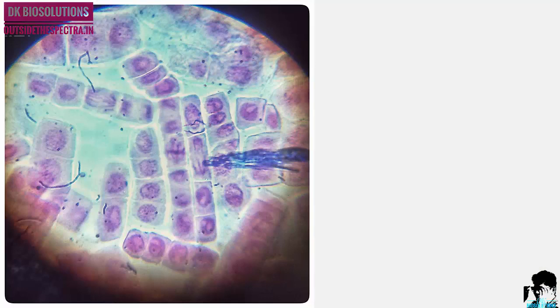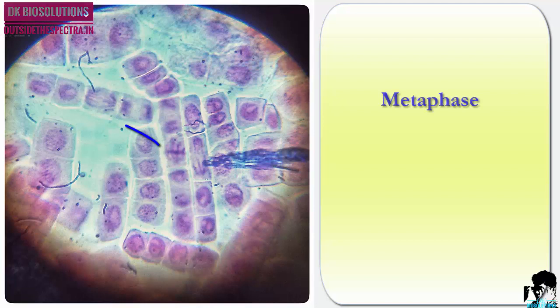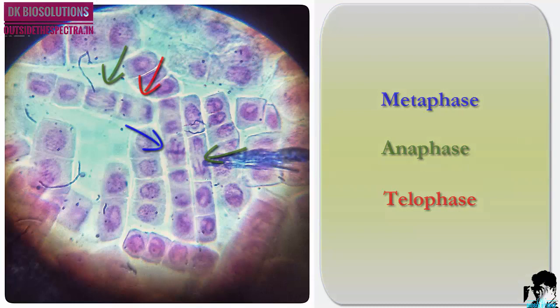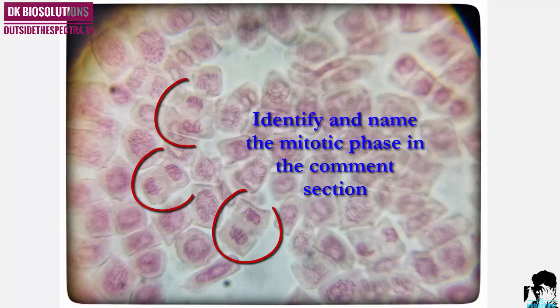Now our slide is ready to observe under the microscope. While observing under the microscope, you will get different stages of mitosis like prophase, metaphase, anaphase, and telophase. Here also you can see different phases of mitosis.